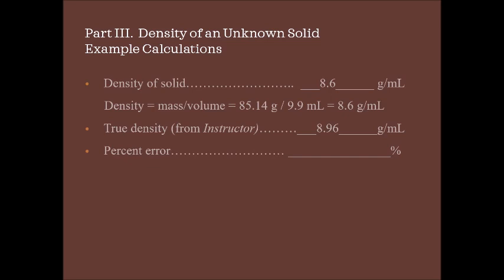If this volume is larger and it's 3 significant figures, then that'll be 3. But in most cases, you'll have a 2 significant figure answer. The density, you're going to get it from the instructor and not the CRC. And the density in this case, for this example, was 8.96 grams per milliliter. So let's go ahead on the next slide and talk about how to calculate percent error.